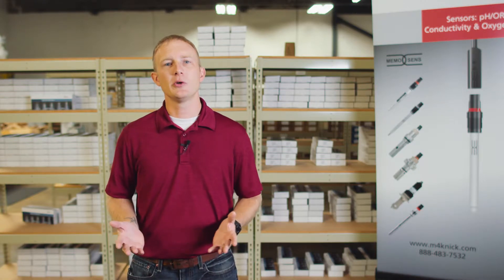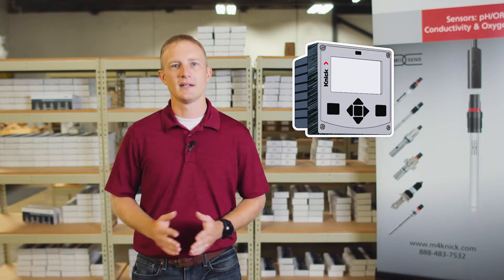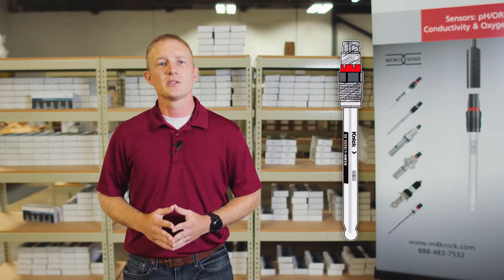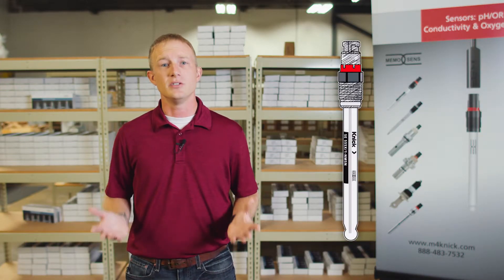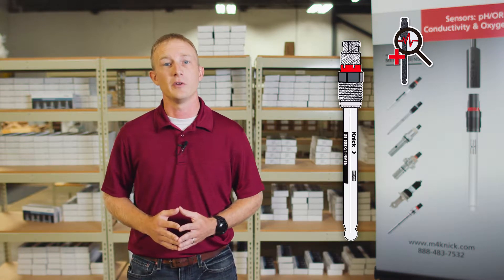Today I'm going to give you an overview of the Stratos Evo multi-parameter transmitter from Knick. The Stratos Evo is a general purpose four-wire transmitter capable of taking up to two sensor inputs for the measurement of pH, ORP, conductivity, and oxygen. When used with MemoSense smart digital sensors, it provides intuitive and advanced diagnostics to help you better understand the health of your measurement loop.